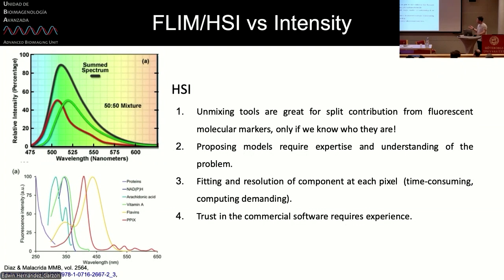And finally, you have to trust commercial software to do that. For example, Zeiss software, they have the linear unmixing. You just select the spectrum, but it is theoretically embedded there, right?